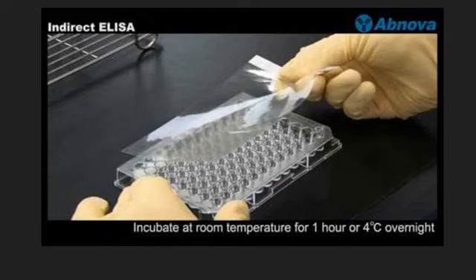Then we remove the excess and do the washing step. They wash the plate by filling the wells with 200 microliters of 0.2% PBST, phosphate buffered saline with Tween 20. Then blocking the remaining protein binding sites by adding 200 microliters of blocking buffer, which is 5% skim milk, the milk powder, in 0.2% PBS. And then an incubation step at room temperature for 1 hour or at 4 centigrade overnight.